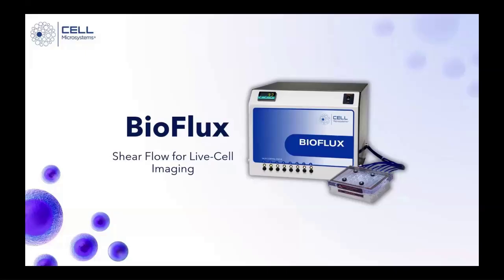Welcome, and thank you for joining today's webinar. Today, we'll demonstrate an experiment that models immune cell recruitment to an inflammation site under shear flow using the bioflux. Specifically, we'll track the adhesion of Jurkat cells, a human T cell line, to a TNF-alpha activated monolayer of cardiovascular endothelial cells that is undergoing a state of inflammation.